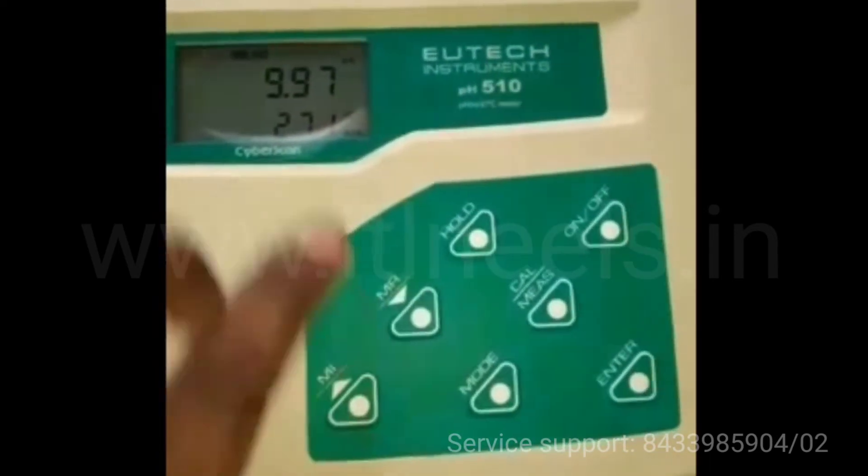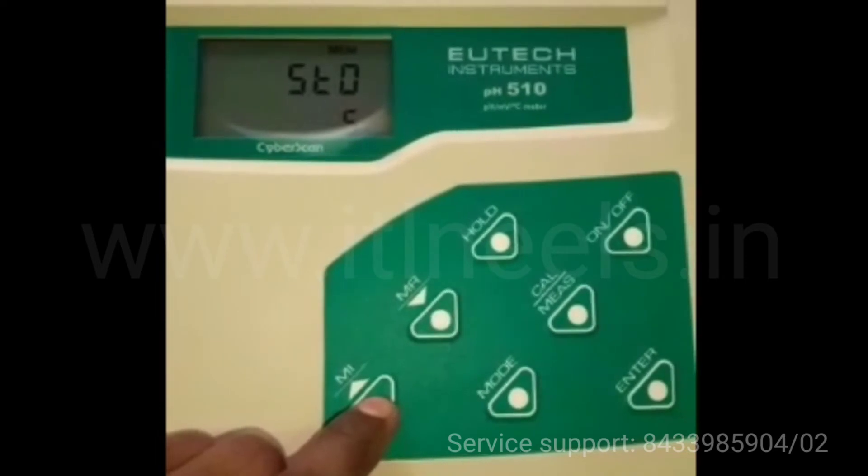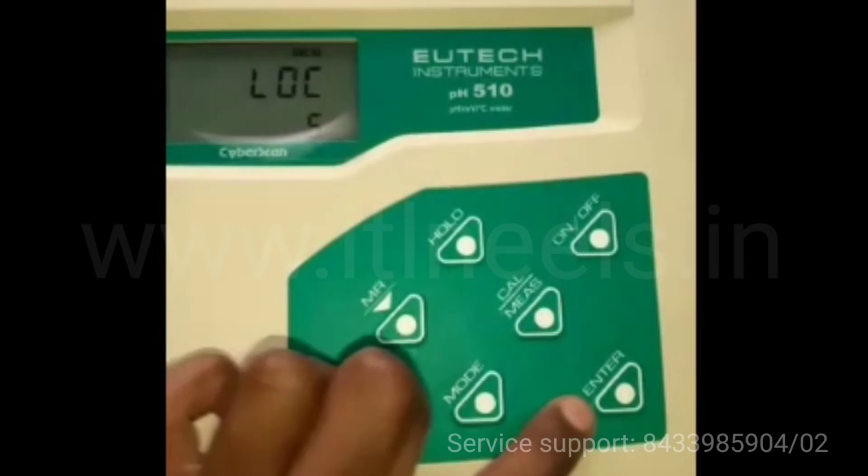If you want to store this data you have to press mI, that is memory in. And if you want to read the stored data you have to press mR.